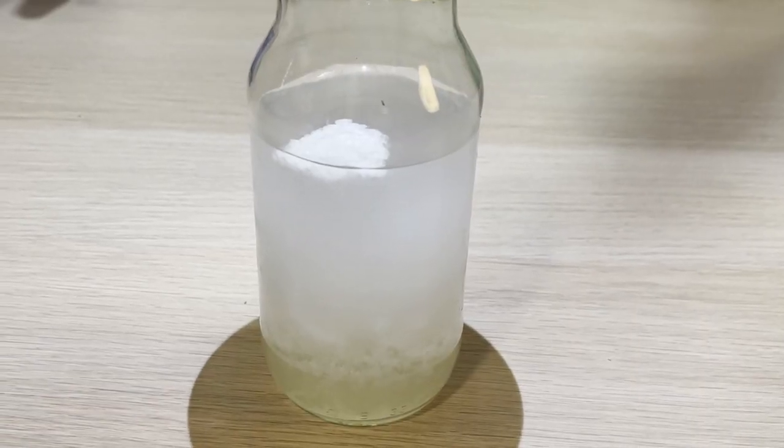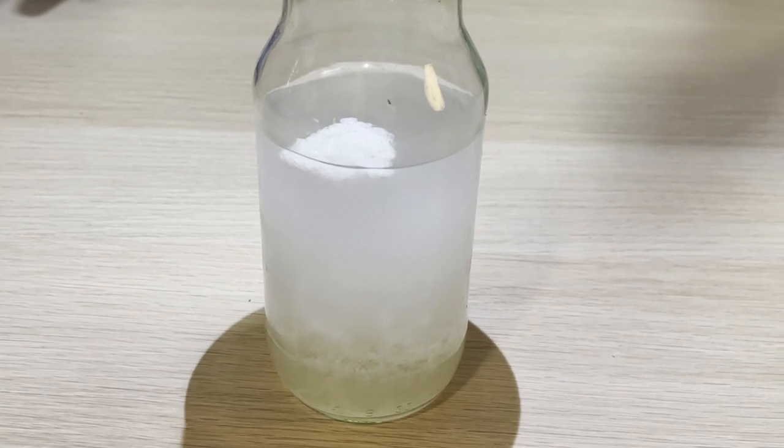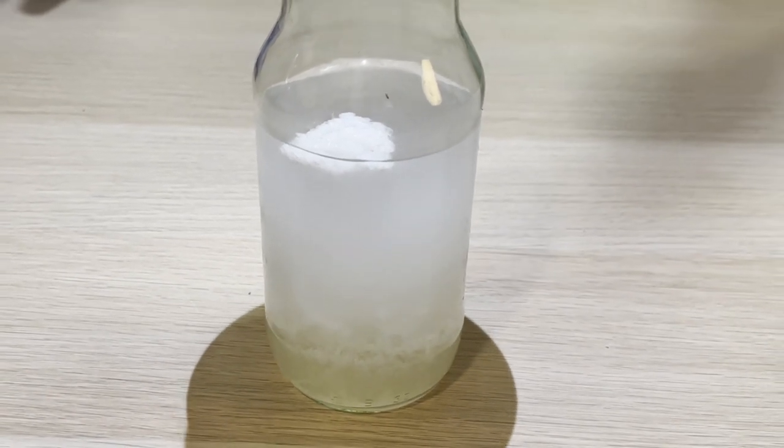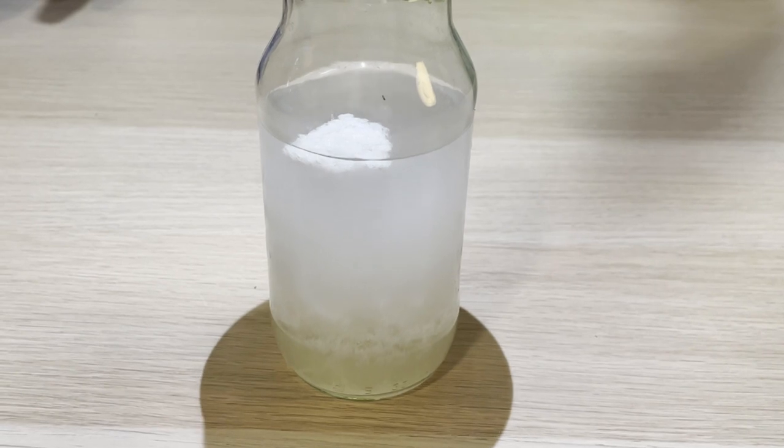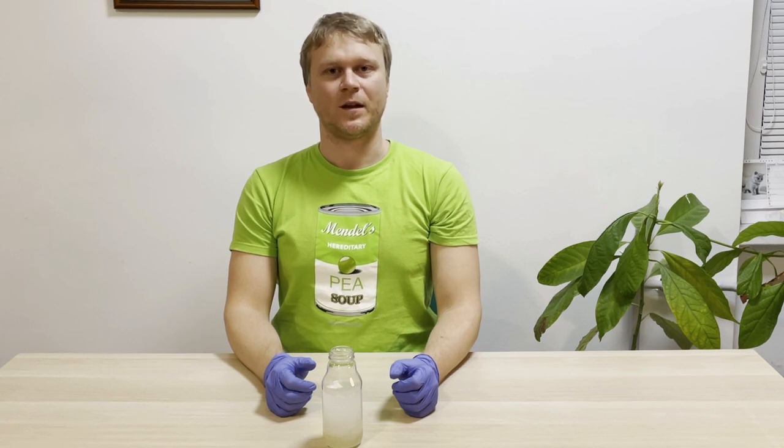If you do it accurately, in the upper phase a whitish jellyfish-like structure will appear. Congratulations! The substance is the DNA itself. This reaction is possible because DNA is not soluble in isopropanol, and in the presence of table salt, DNA will sediment.